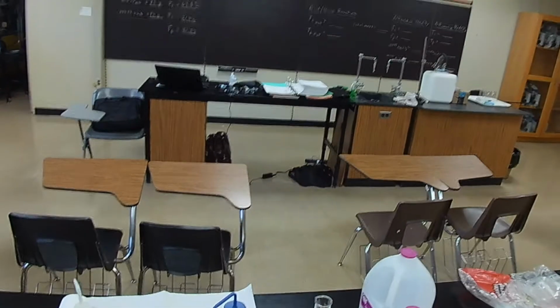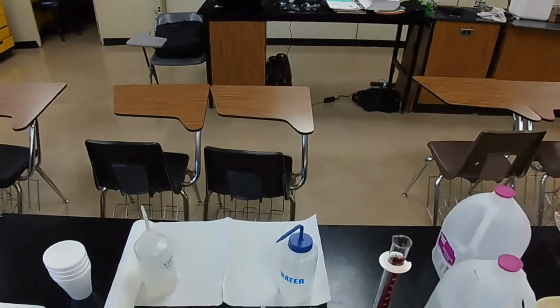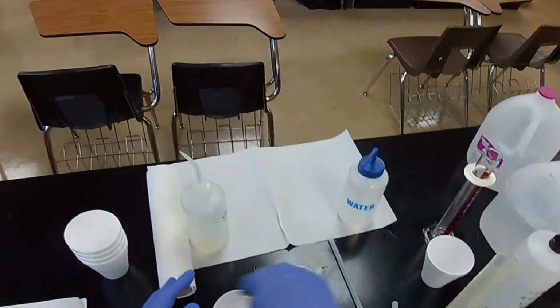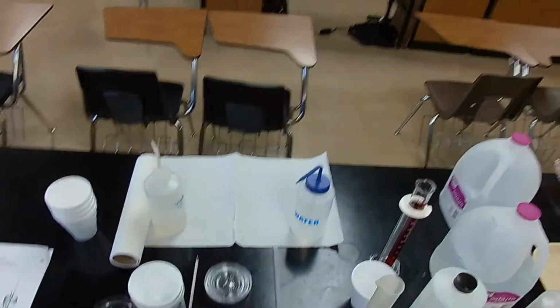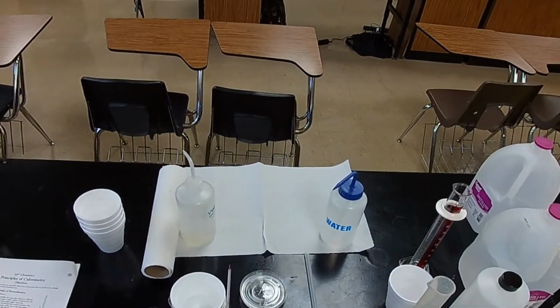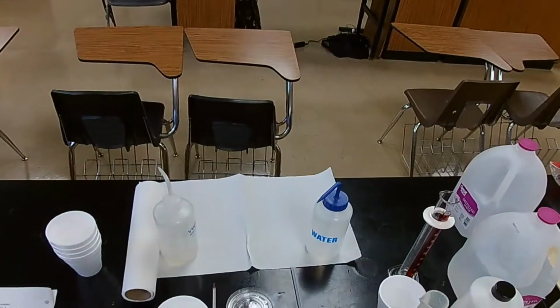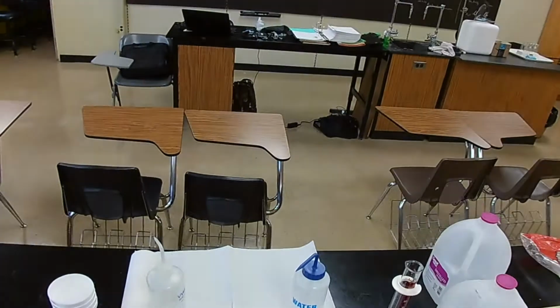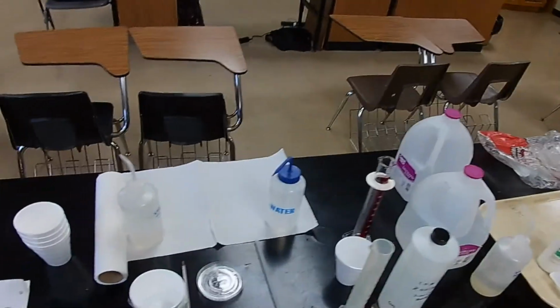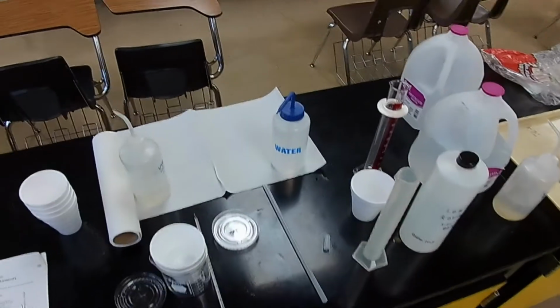Now, what does that do for our calculations? Well, we need to know the total mass of the water in here. And we're assuming that the specific heat of this solution is that of water. And the concentrations are so low that that's an accurate representation for the specific heat of this reaction mixture.